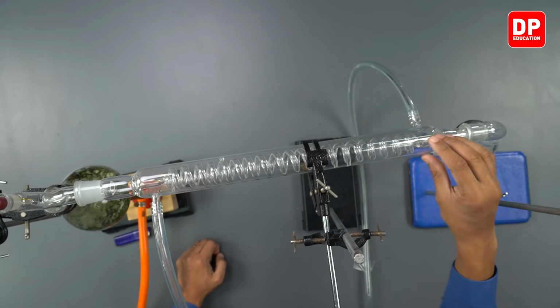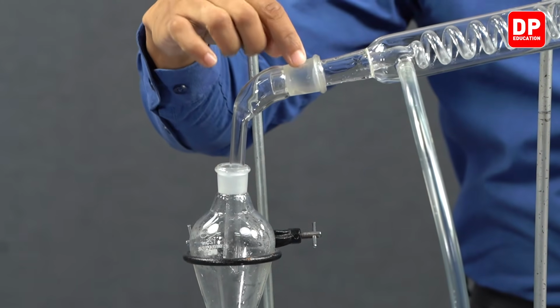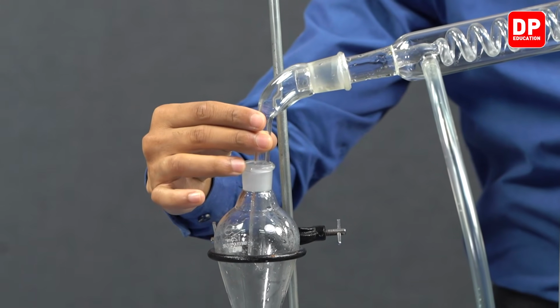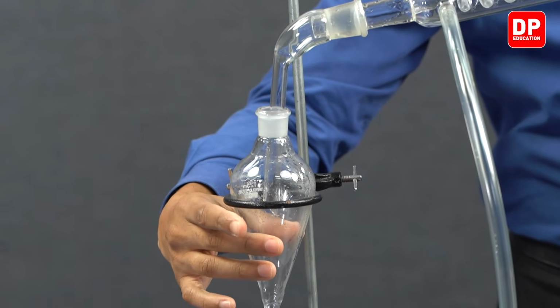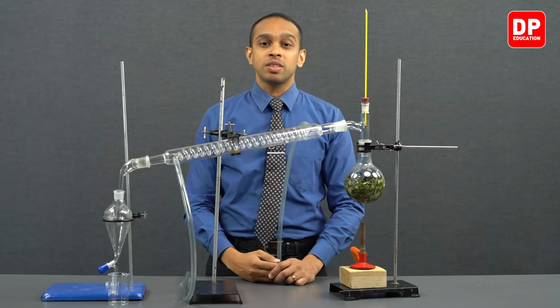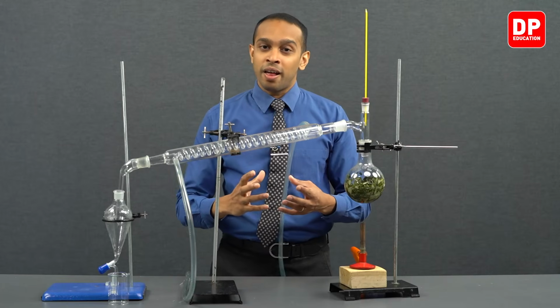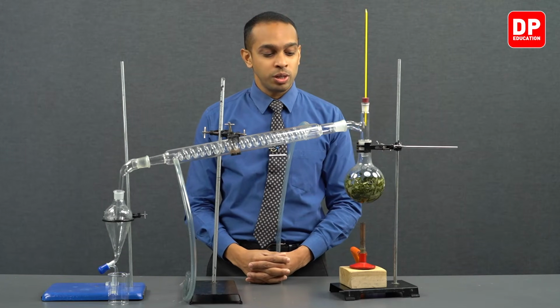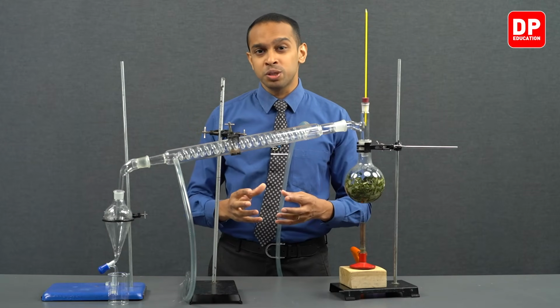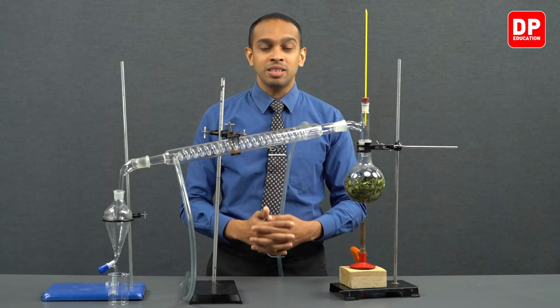So this liquid will be collected at the end of the condenser, and this bent distilling adapter that we have connected over here will direct that liquid mixture into this separatory funnel. And later on, with the use of the separatory funnel, we will be able to separate out the oil and the water.